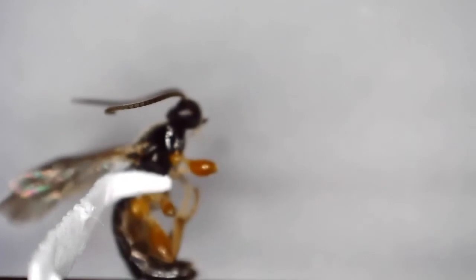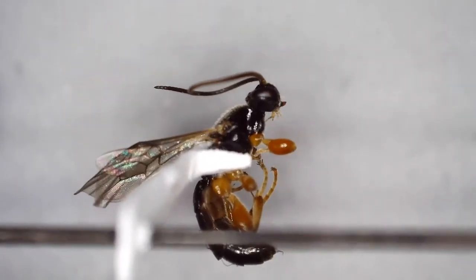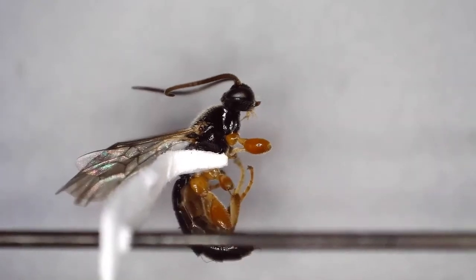So here I'm trying to get it a little bit in focus for you to see that it is glued on the right side of the thorax. And that is the standard point mounting position whenever you are point mounting any of your small insects. So you put that away and you let it dry before you mess with it any further.